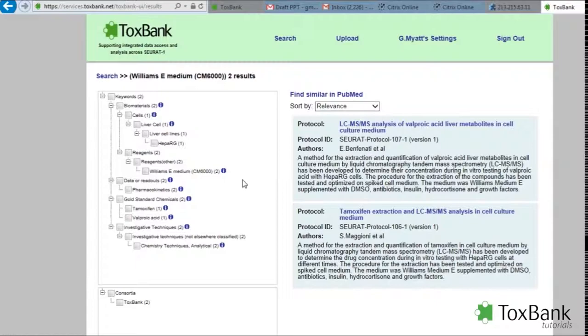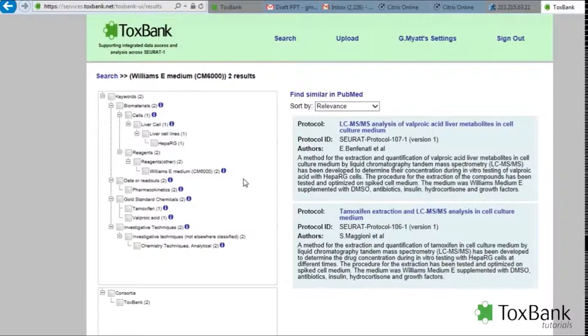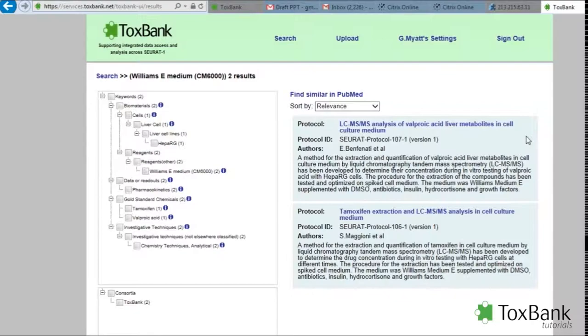So in the warehouse, once a protocol or an investigation is uploaded, there's an opportunity to assign keywords to that investigation. Those can be linked to the wiki which also has information on those keywords, in this case, the reagents.